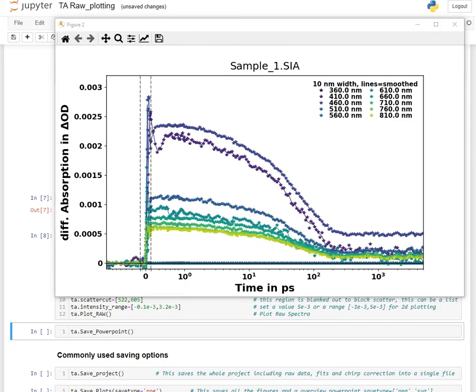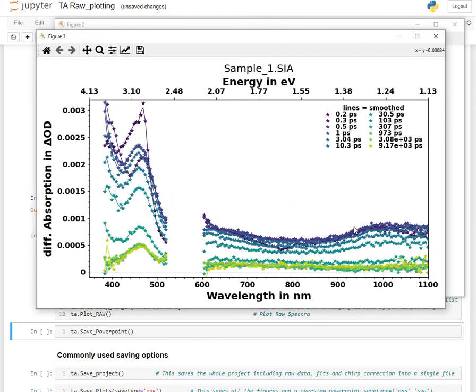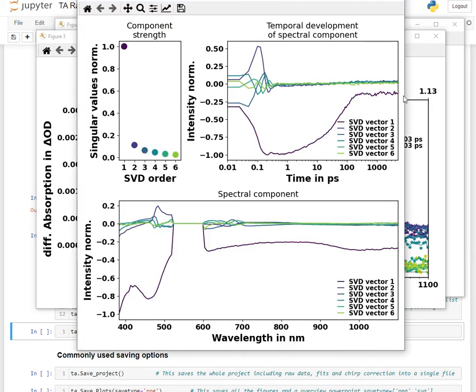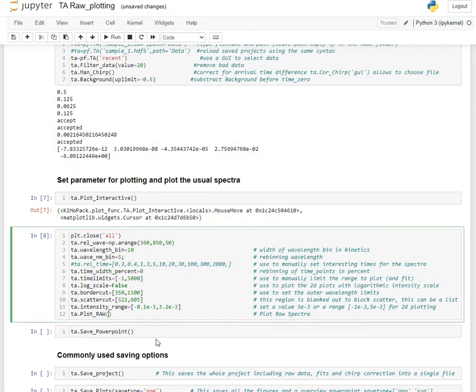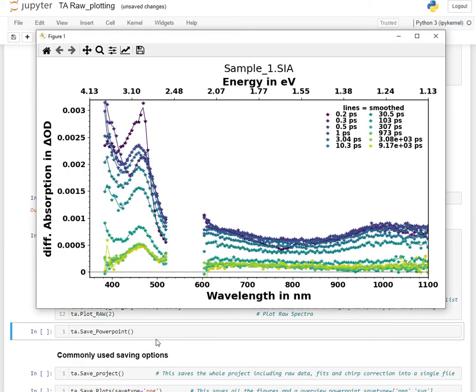It generates the spectra with the slice where there's the scattering, and it generates the SVD of the data, where you can, for example, look at how many different components you have, what the typical times are, and what the typical spectra are. If you want to use just one, you can use the options, for example, just using 2 generates only one of the plots.